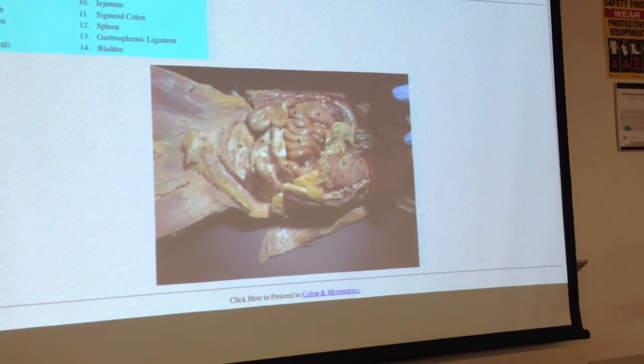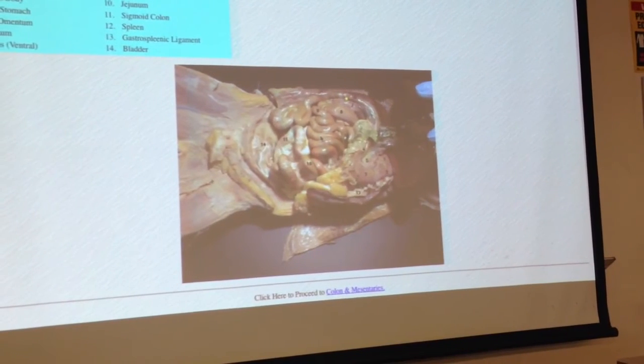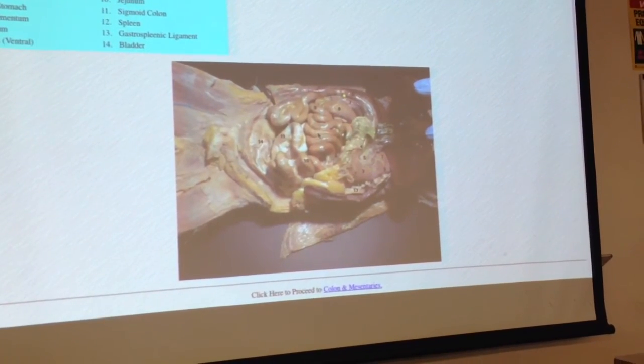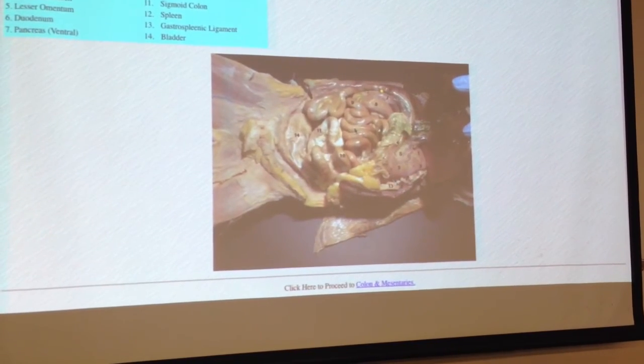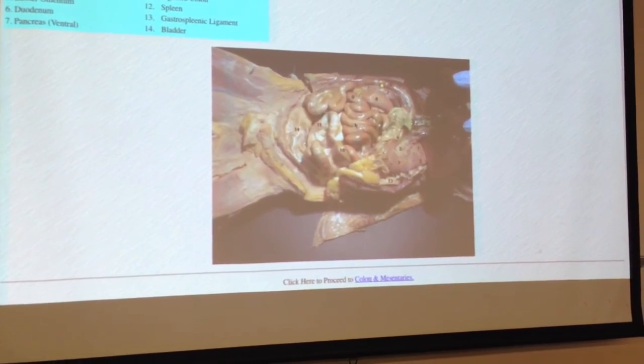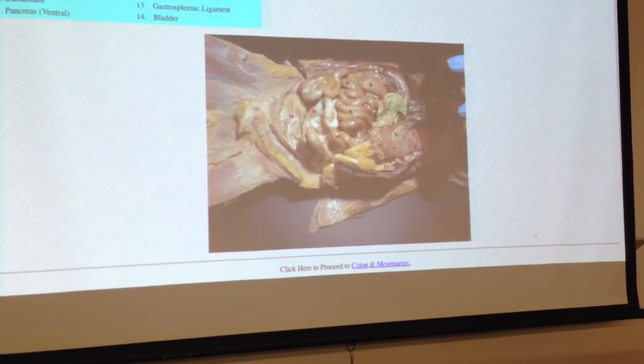Now, take a look at the large intestine section. For what you need to know for the cat dissection, you'll notice that there's an X for ascending colon that says if present. Most cats do not have an ascending colon, and I've even seen a few that don't even have a transverse. Their colon just doesn't take up as much space.